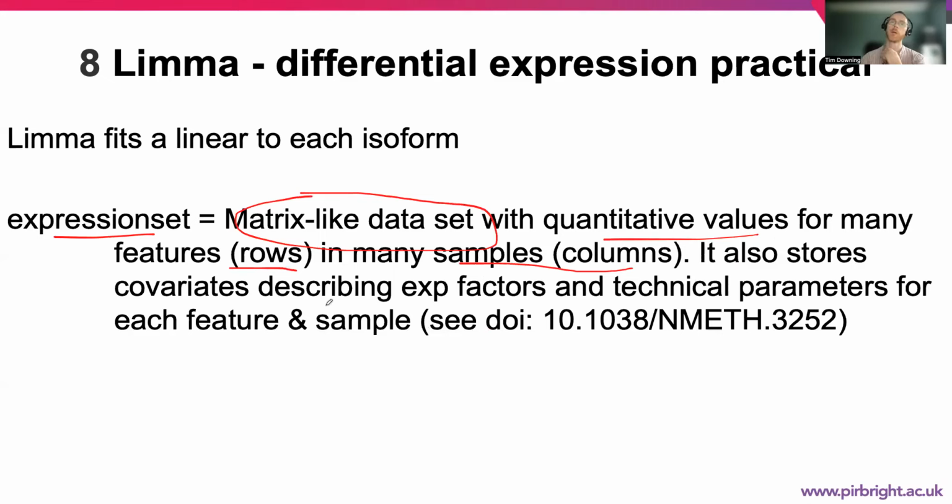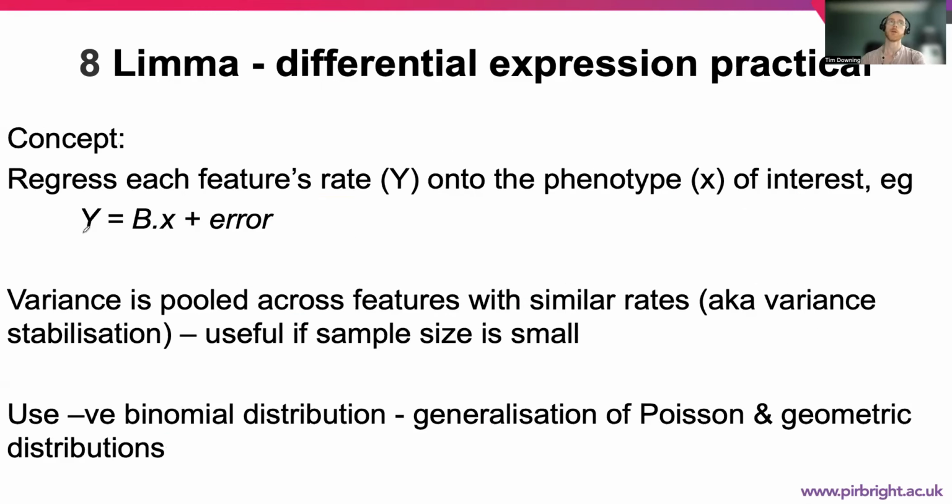It also stores other metadata explaining the context of the different experiments that are applied. In general, what we're doing here is looking at the response of the reads found at a particular transcript, and seeing whether the treatment, listed here as a beta coefficient by X, some treatment, plus the intrinsic variability associated with each particular sample, is large or maybe actually close to zero.